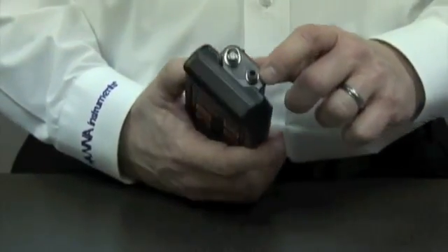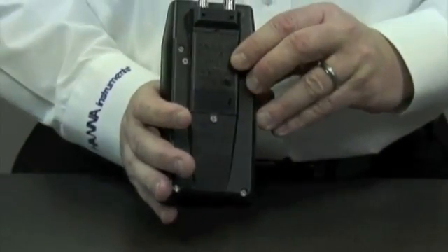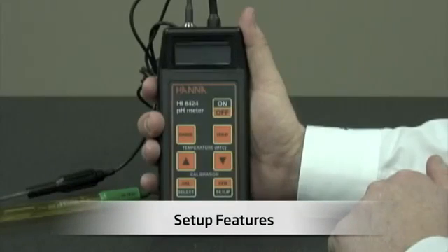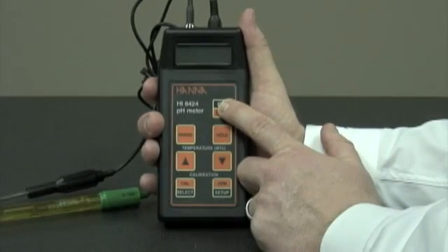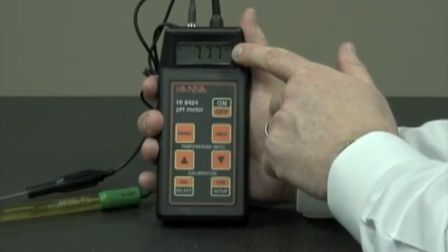We have an RCA connector for the temperature probe, a BNC connector for the pH probe, and we have the battery compartment. Now we'll hook up the probes and turn the meter on. Once inserted, you'll immediately see the battery percentage level, and now the display is showing pH.